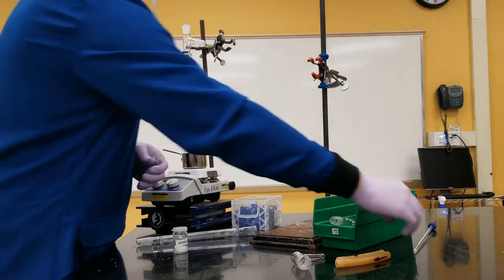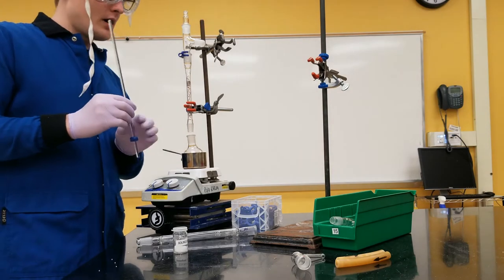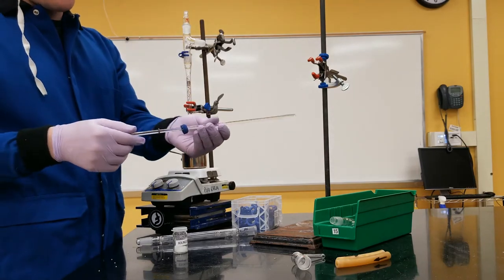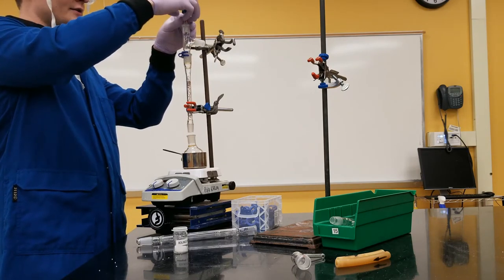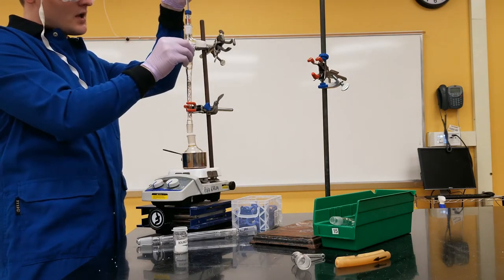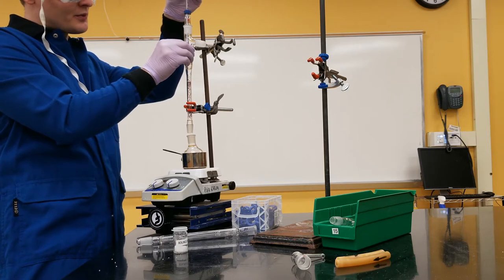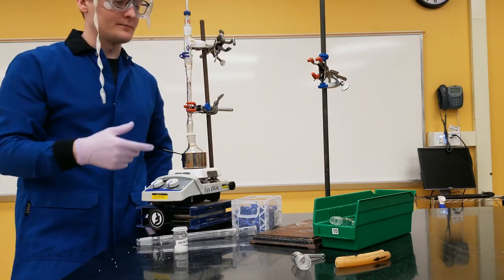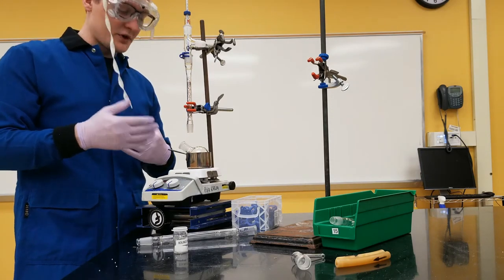So the first thing that I'm going to attach to my three-way adapter is a thermometer. I've got a little thermometer adapter up here, and I have a thermometer which I've rigged up to seal down onto this piece of glass to create an airtight seal so that no gases can escape the top. And then I'm just going to wiggle this thermometer so that the thermometer bulb, which is reading the temperature, is below this arm that's going to let the vapors out. So the purpose of this thermometer is to tell me which solvent is coming across.